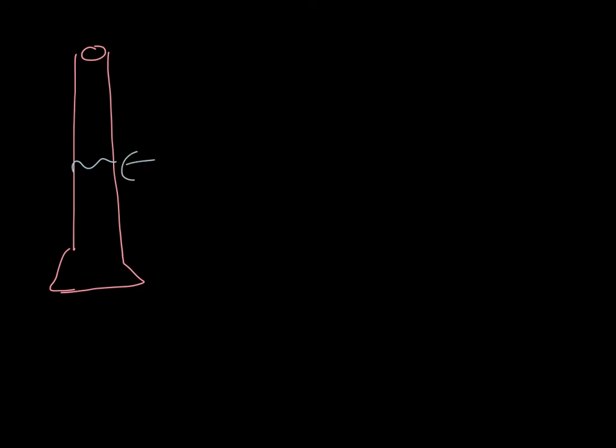Alright, I have my graduated cylinder here. You're going to use your imagination that that's a graduated cylinder. And I start off my experiment with 52.1 milliliters of water. So that's my volume initial.